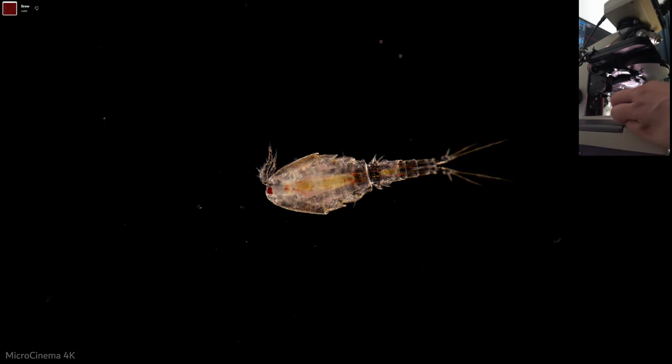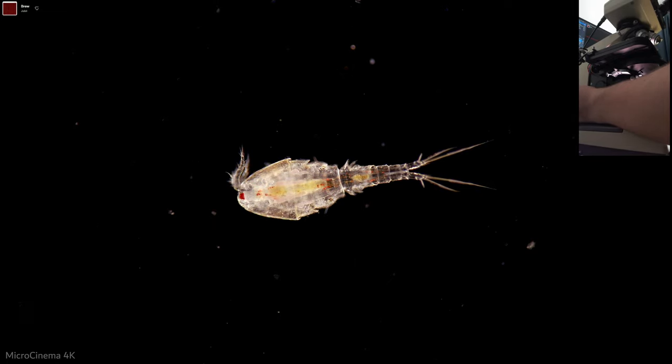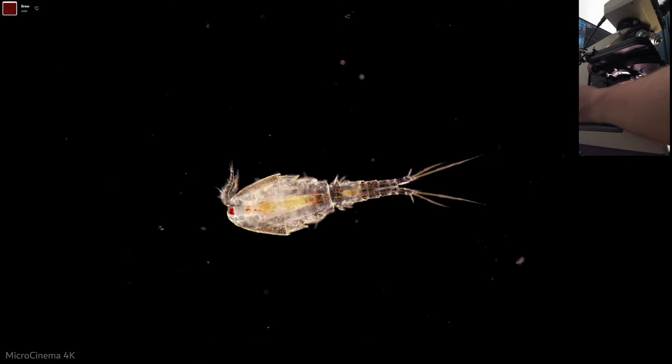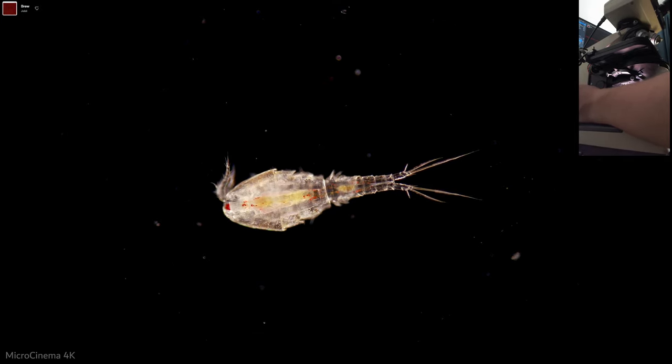And then I'm just going to bump up my ISO on the camera so we get a nice exposure on this copepod. And so here we are, I'm using my 4X S plan Apo lens and we're getting just a beautiful inky black dark field with this wonderfully exposed copepod.